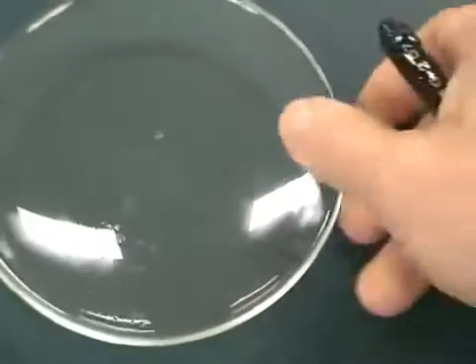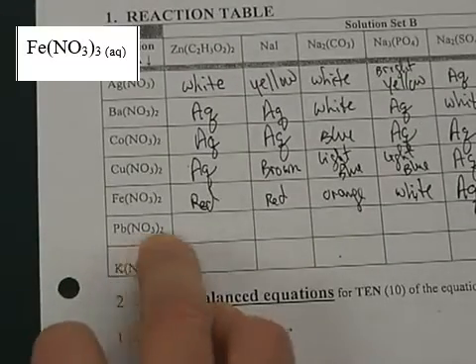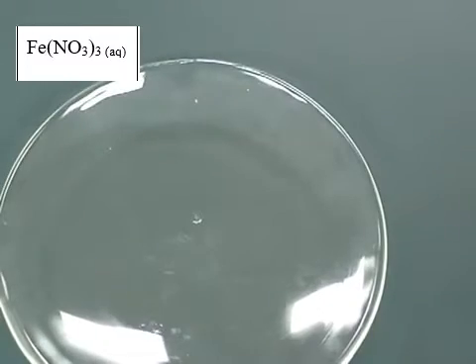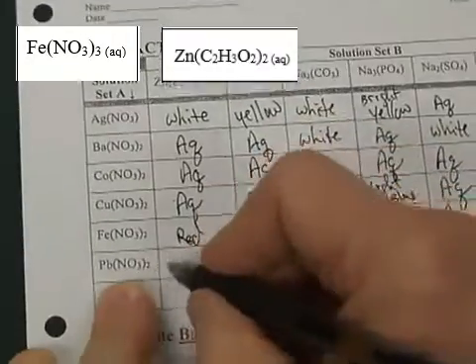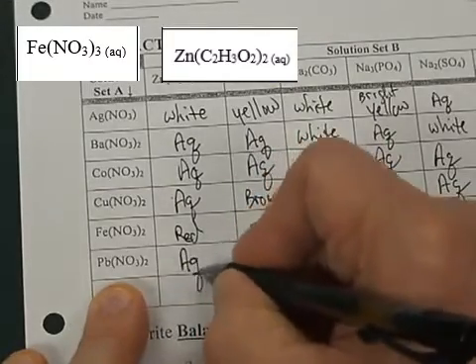One more round. The last chemical here that will actually react is the lead nitrate with a 2, so it's lead(II) nitrate. All these are transition elements here, so they have to have special names. The lead nitrate, Pb(NO3)2. The zinc acetate, the very first one, so we might as well write that in here. Lead nitrate and zinc acetate do not react, so we would call that aqueous.